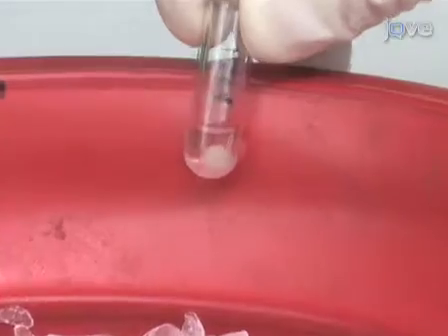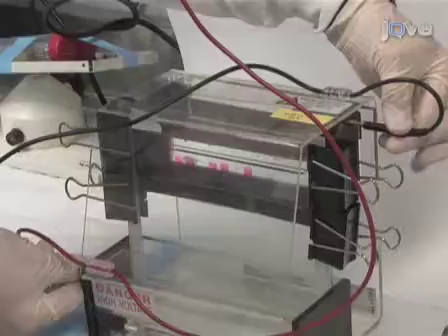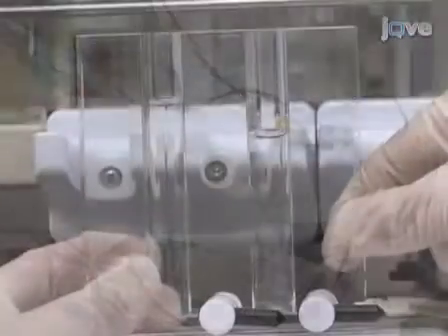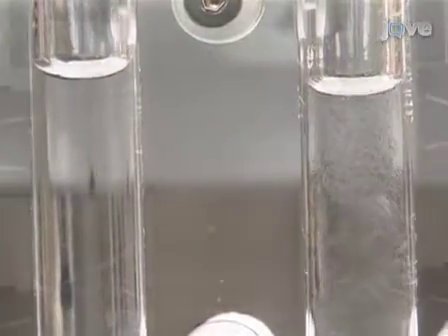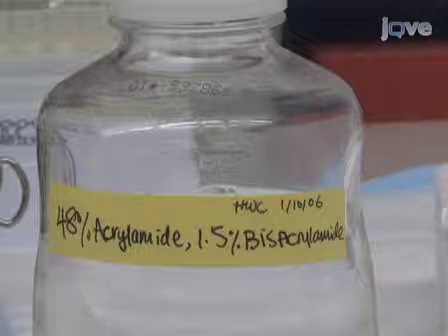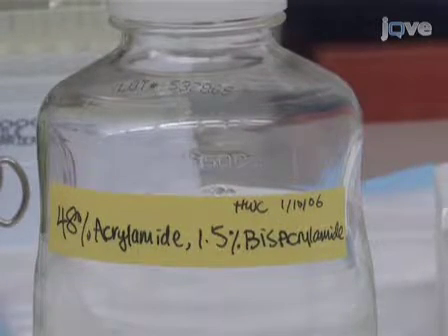We will then collect the clear supernatant, and we are now ready to prepare it for running on our gradient gel. For native gradient gel electrophoresis of mitochondria, we recommend using an acrylamide gradient gel from 5 to 13% with a 3.5% stacking gel. To prepare the gel, we will use an acrylamide bisacrylamide mix as described in the written protocol. Acrylamide bisacrylamide solution is prepared in advance and stored at 4 degrees Celsius in a dark place.